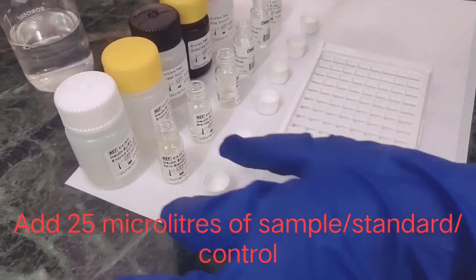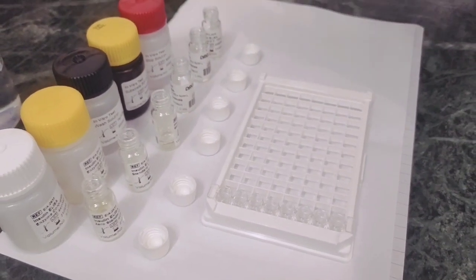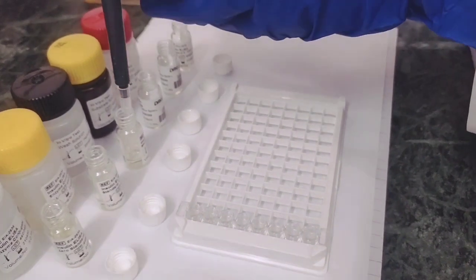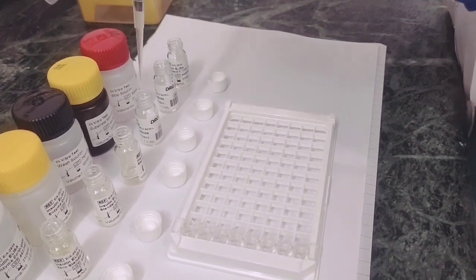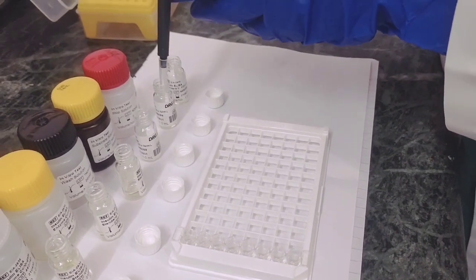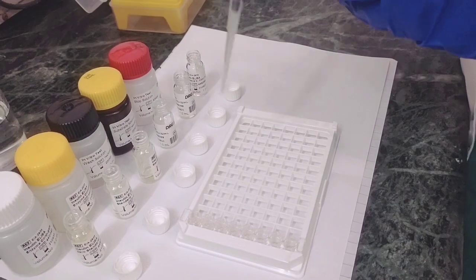So now we are taking the standard 0, 25 microliters, the standard 1, the standard 2, standard 3, standard 4, and the last standard 5.